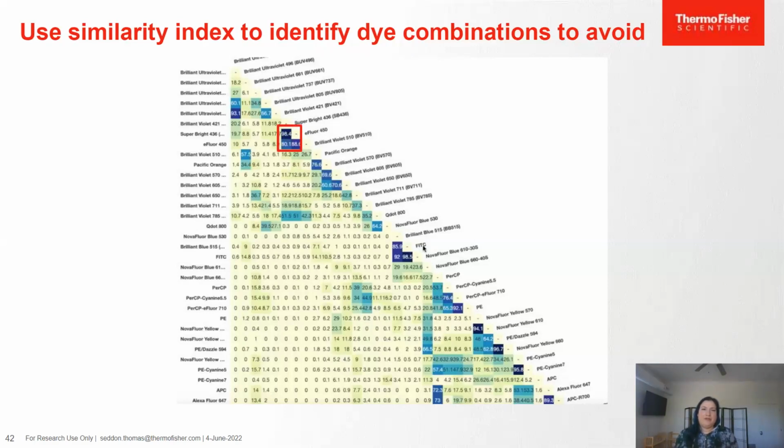Interestingly, when you put, say, 3 dyes that are in a similar place, there's actually worse unmixing than you see with any of the individual dyes. This is what I mean by spectral bunching. So while you can use this, it leads to worse issues that are captured.